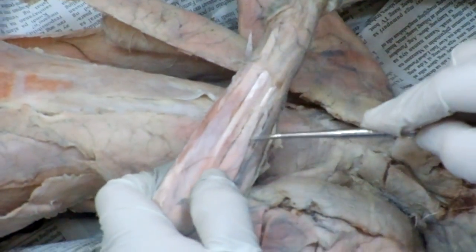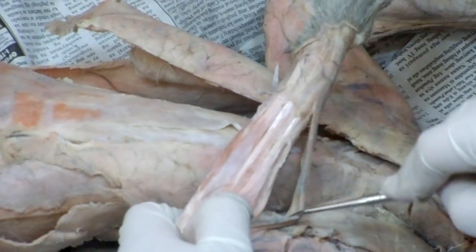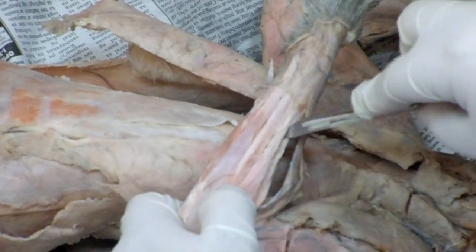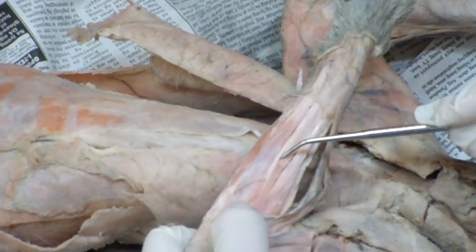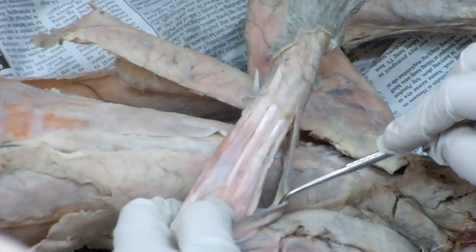Next, extensor digitorum communis. Next to the preceding. Origin: just above the preceding. Insertion: like the preceding. Okay, so extensor carpi ulnaris, extensor digitorum lateralis, extensor digitorum communis. Next.